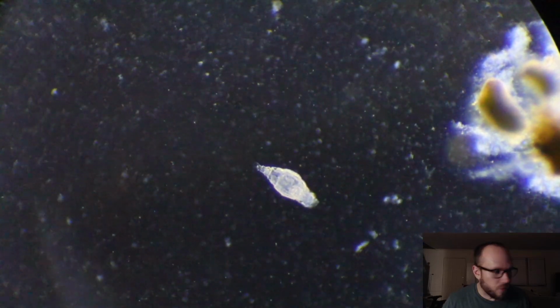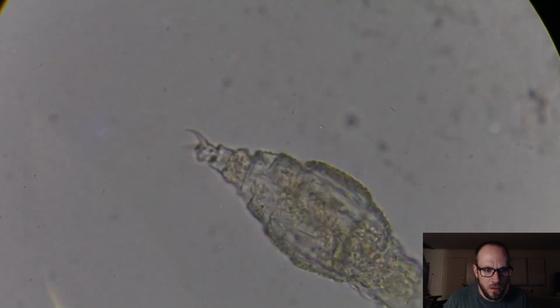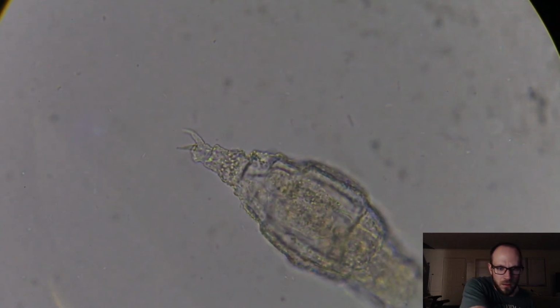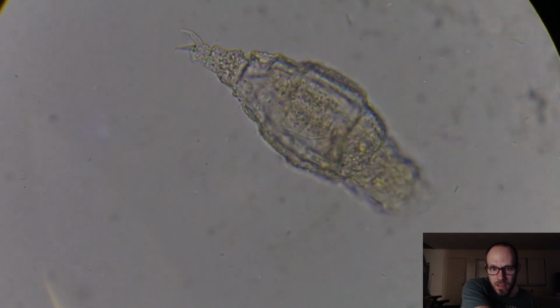But you can tell it's a Rotifer, because if I go up to 400x here, since he's so intact, let me just give us some contrast here and center him. Oh, wrong way. Okay, so he's got the Rotifer anatomy. There are his 2 feet, those little spike-looking things. Aw, how sad. Yeah, he's dead.